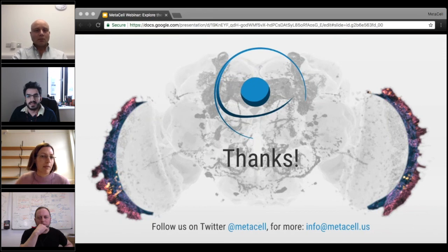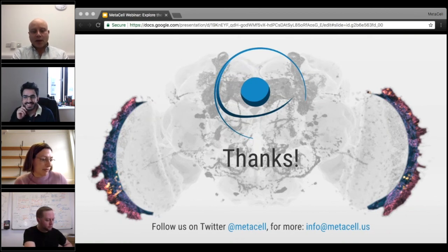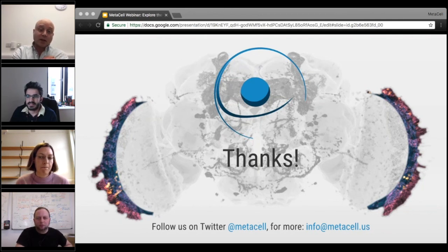Okay. And David, you want to add something? I saw your lips moving. Yeah, not for this particular case, but we do have cases where driver lines are broken down. We've got split images coming, but we also have cases where driver lines are broken down clonally into their components.